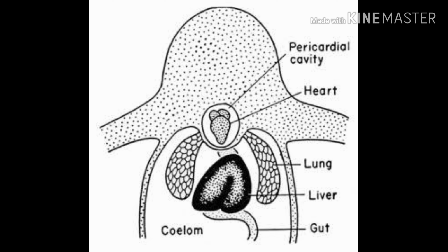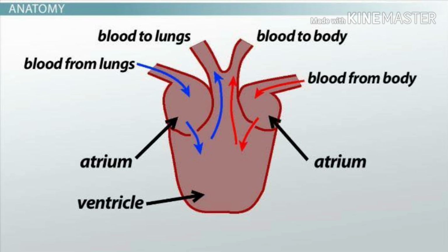And now we're here at the internal body parts of the toad, which are composed of two coelomic cavities, one of which is the pericardial cavity, a small cavity that holds the heart. So, the heart is a hollow pear-shaped muscular organ situated in the anterior part of the body cavity in front of the liver.